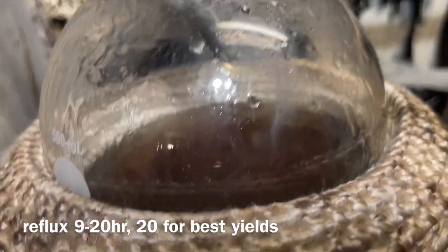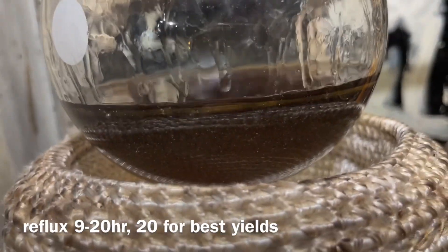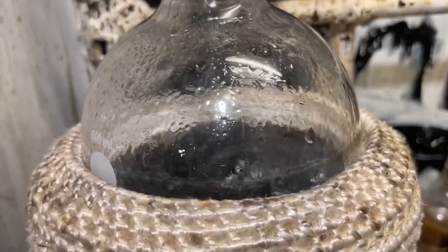The boric acid increases the yield — I don't know how, but it just does something. Reflux for 9 to 20 hours. I did it for 6 hours because I didn't have enough time, but that seemed to work fine anyway. I got a 47% yield, which is acceptable considering I shortened the reflux time.